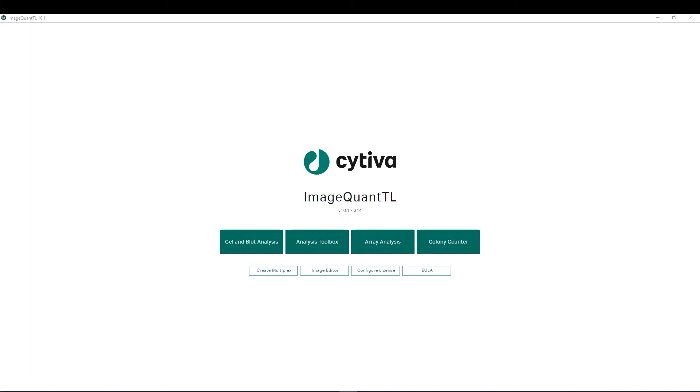This is the main hub you see when you first open the software and we have modules for different types of analysis including GEL and BLOT analysis, analysis toolbox for more free-form analysis of such things as tissue sections or TLC plates.